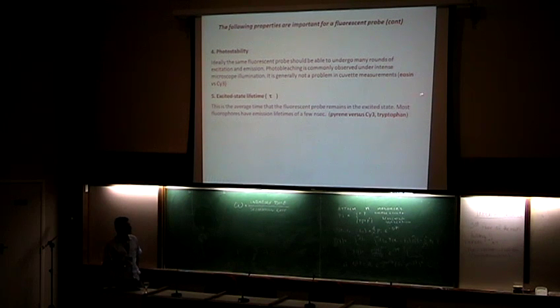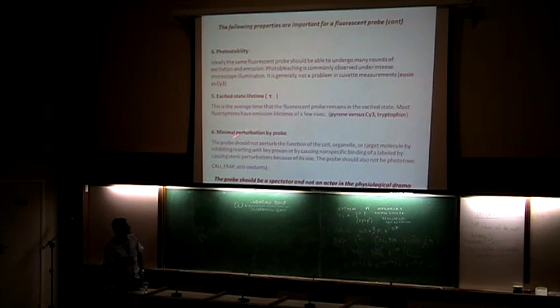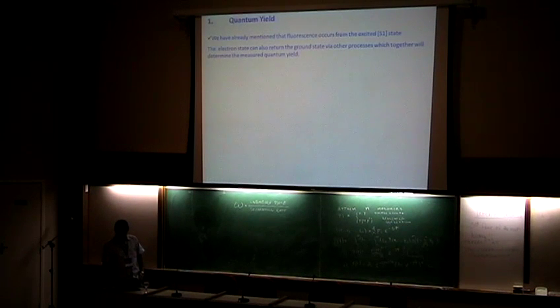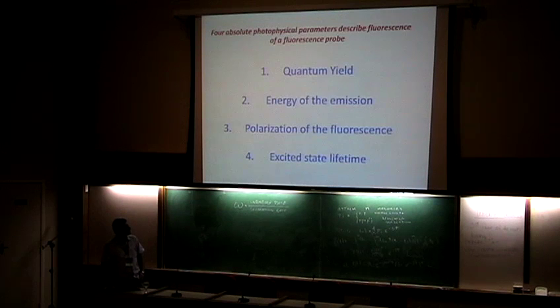Tryptophan has a short lifetime, around 3 to 4 nanoseconds. Pyrene, for example, has around 100 nanoseconds. So you have to be careful, because if you are dealing with a reaction with the excited state, and it decays before it reacts, then it will be no use. And of course, the probe we use has to be a spectator and not an actor in your experiment.